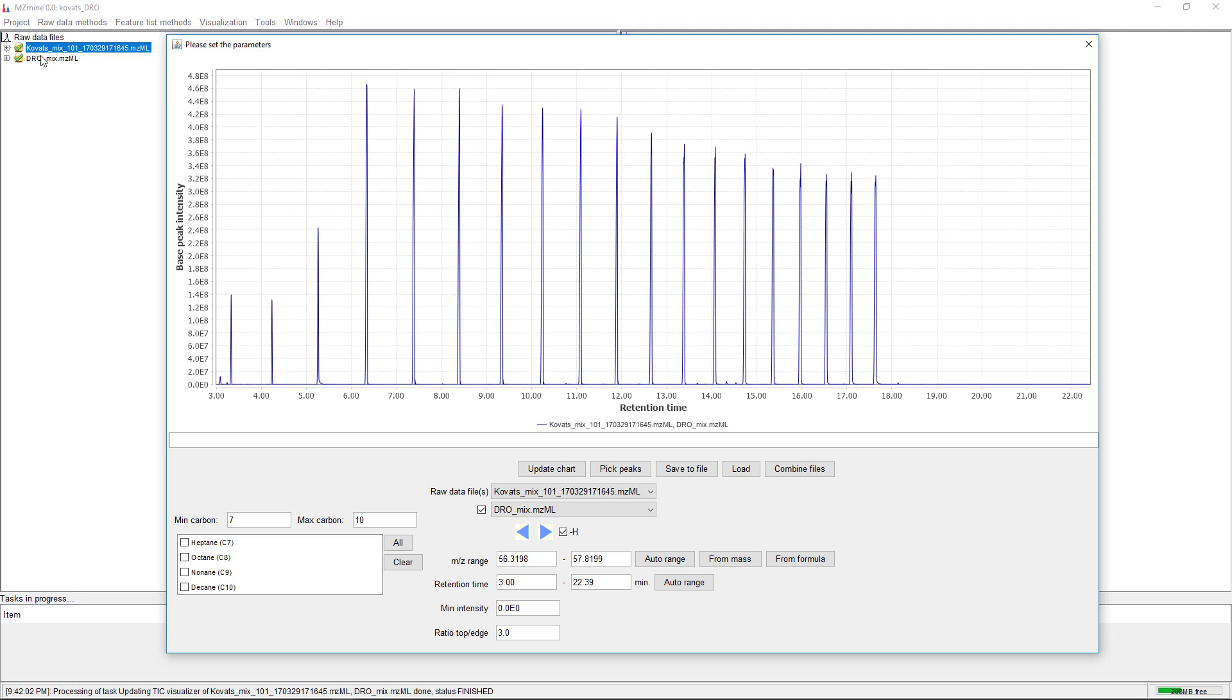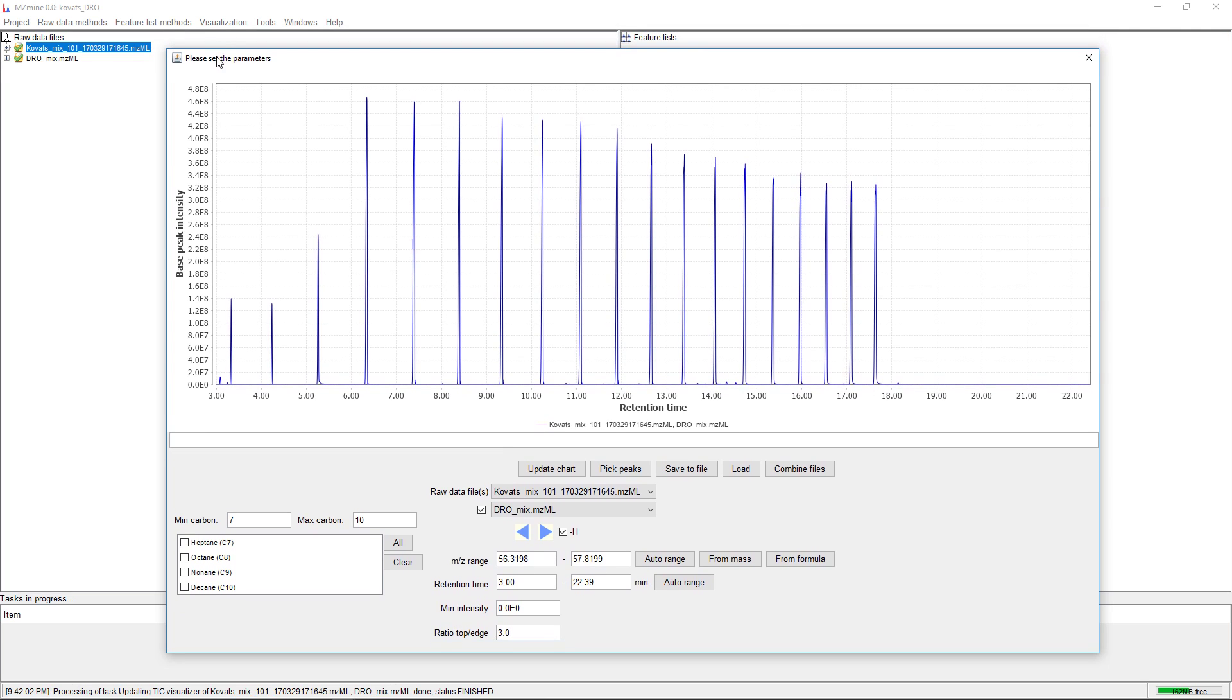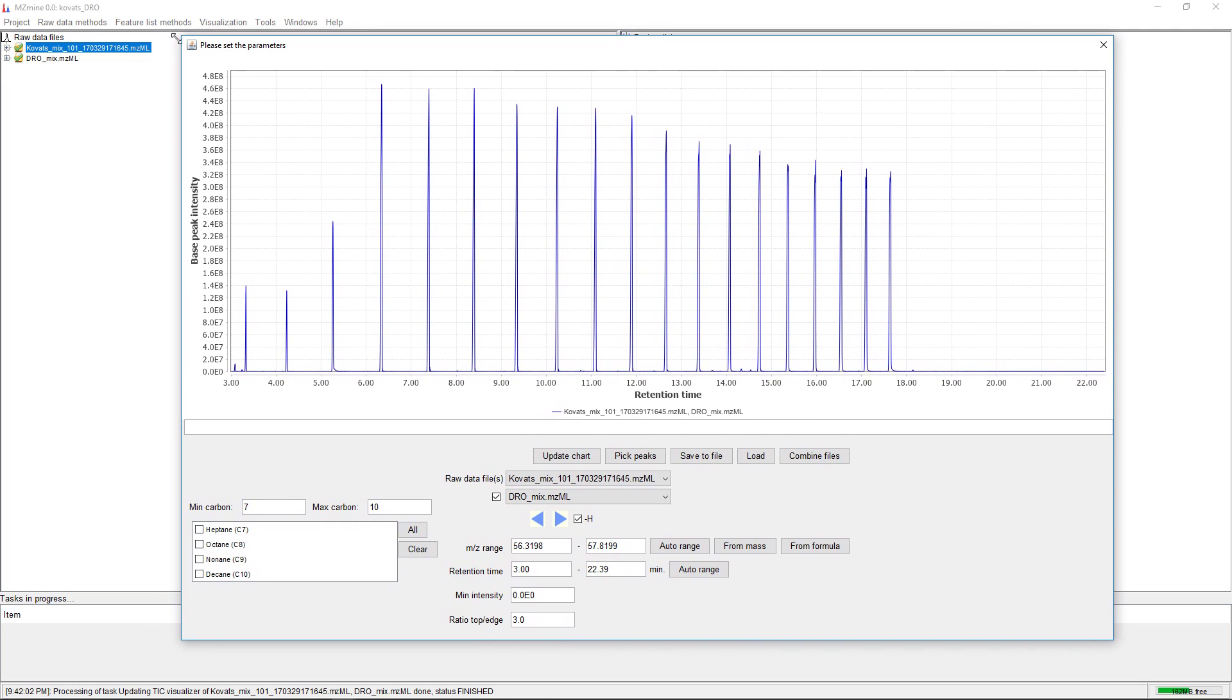If you want to also submit Kovacs indices into the GNPS workflow, you can use mzmine to pick the retention times of your alkane mix.